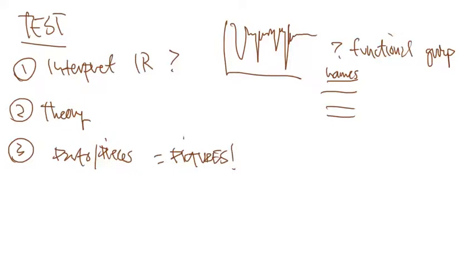So if I show you pictures of the light source, if I show you pictures of the monochromator, are you able to pick those out? If I show you pictures of salt crystals, if I show you pictures of a gas chamber for the infrared, if I show you a picture of the ATR attachment, are you able to identify those? That's the parts and pieces category.